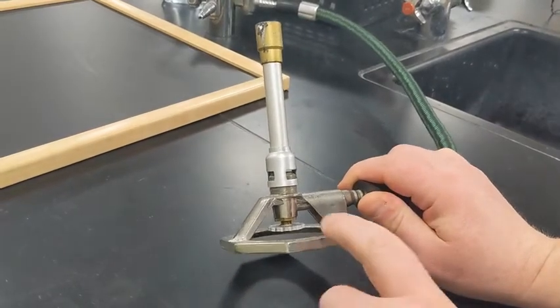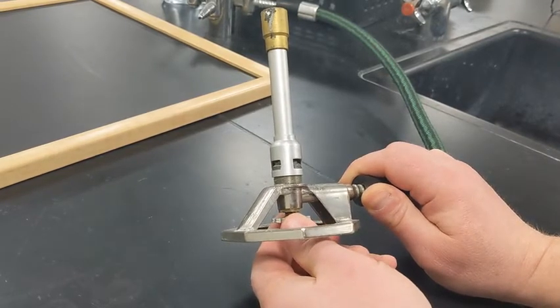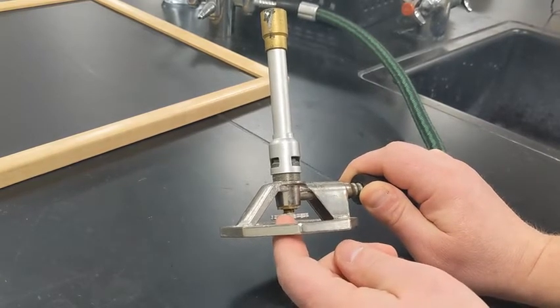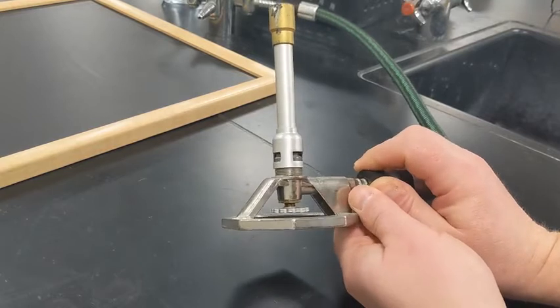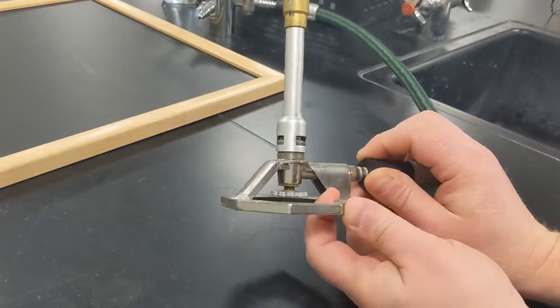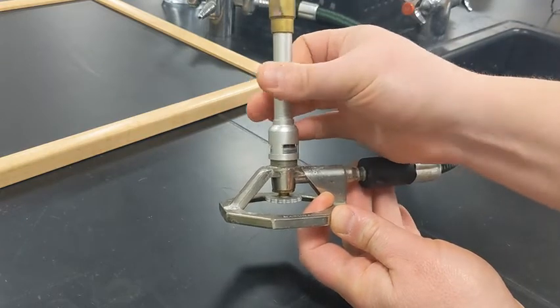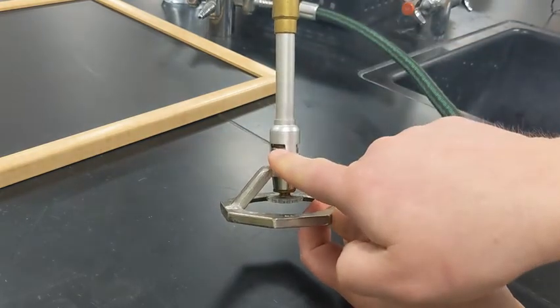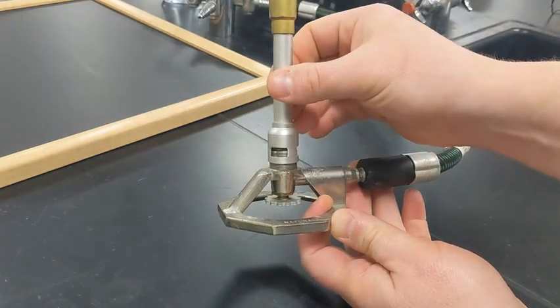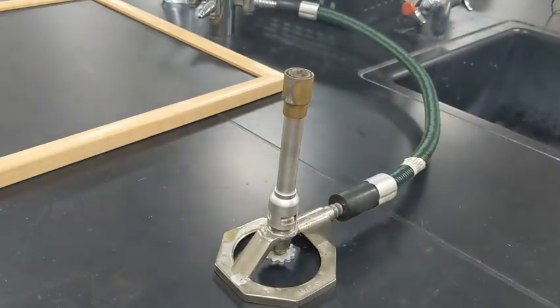This one down here — turning it clockwise or counterclockwise — changes the amount of gas that goes in. This should not be the one you adjust first, because it should be set from the last time someone used it. Instead, the one you might need to adjust is this one here, which moves up and down, changing the amount of oxygen allowed in to create our burn.